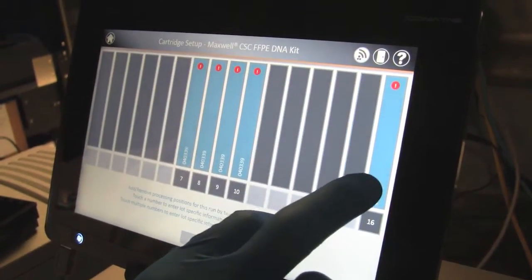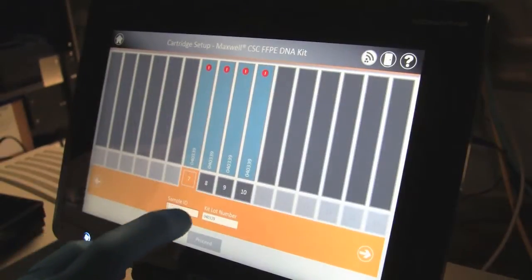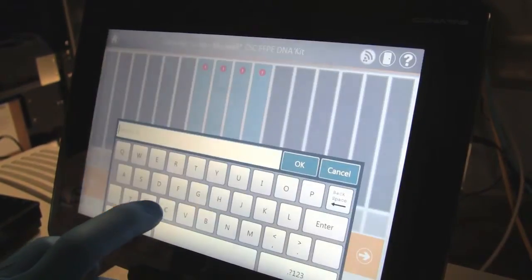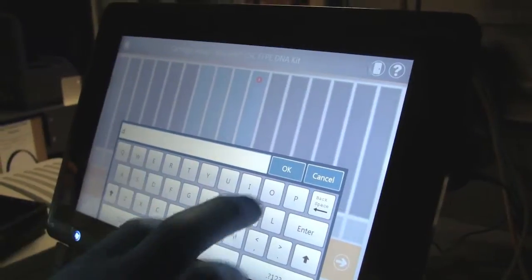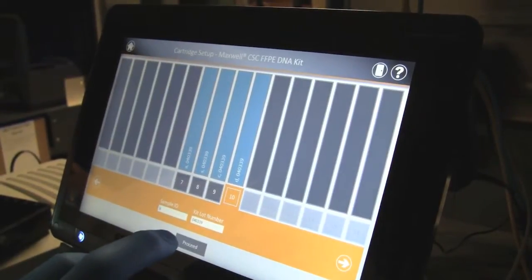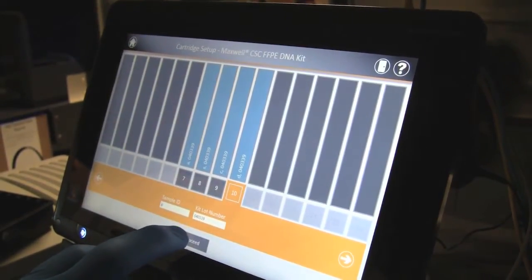Select the cartridge positions to be run and scan or manually enter the sample tracking information. Deselect any unused portions. Select Proceed when ready.